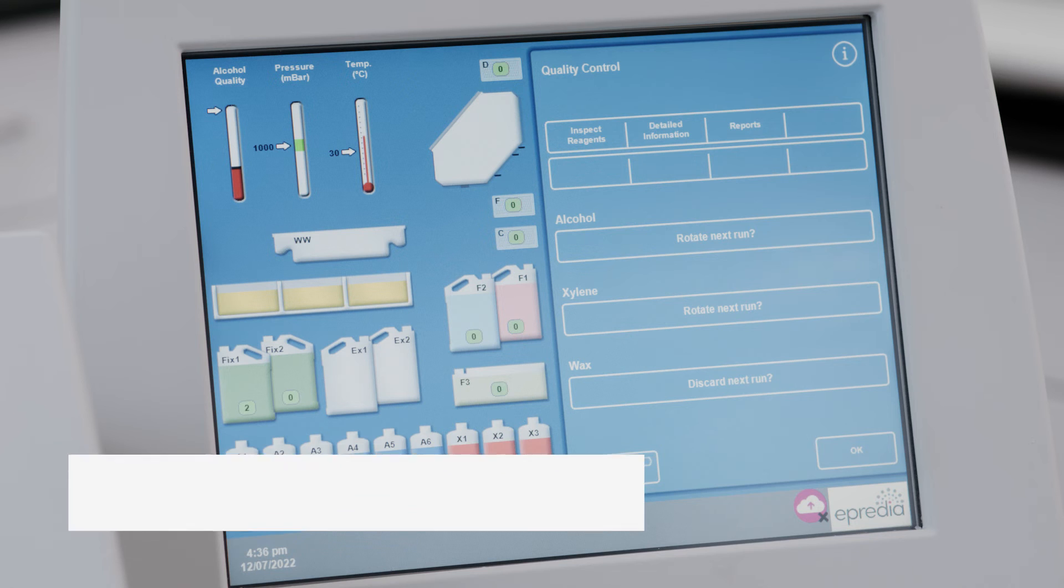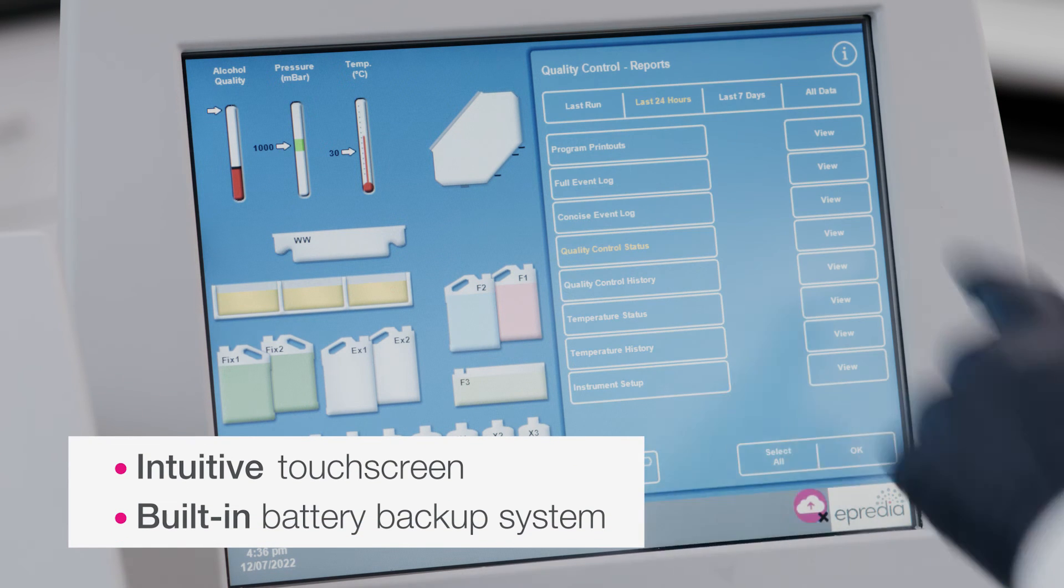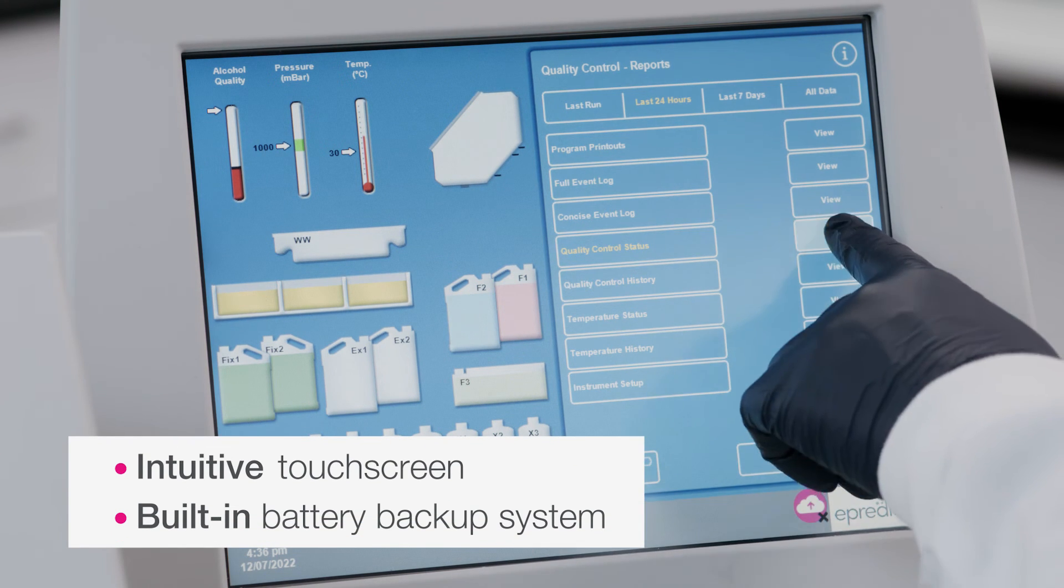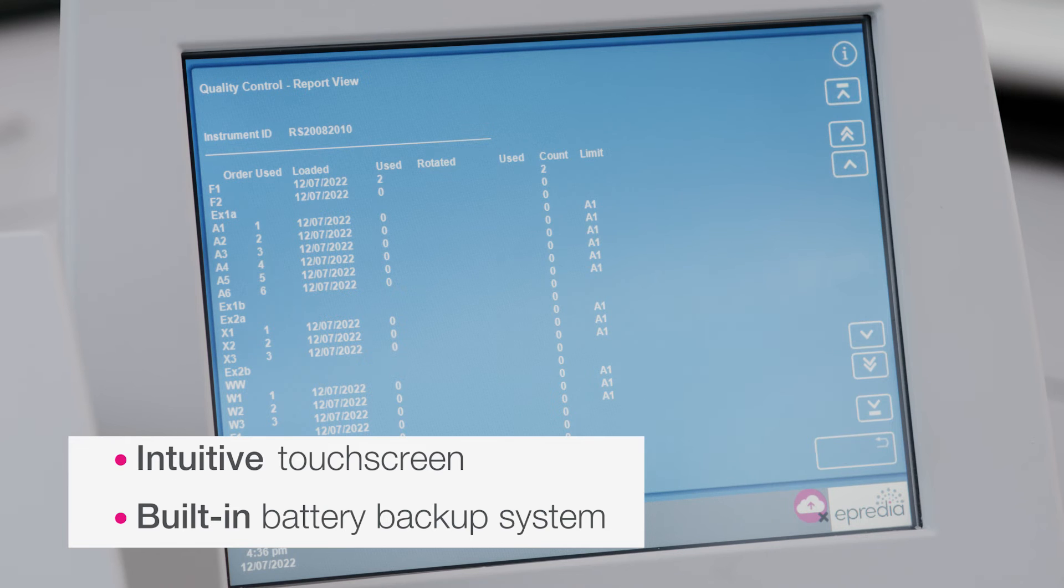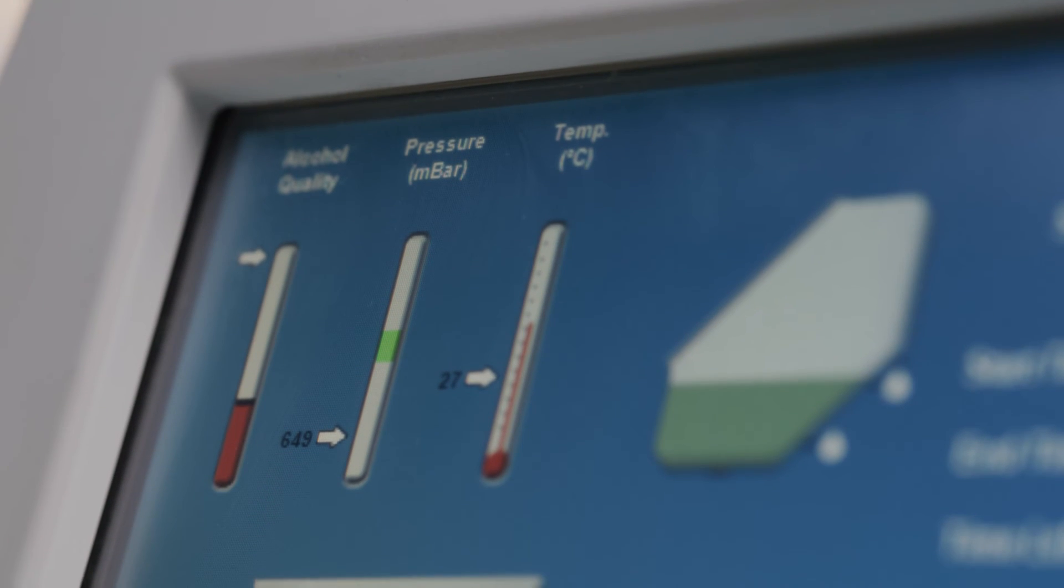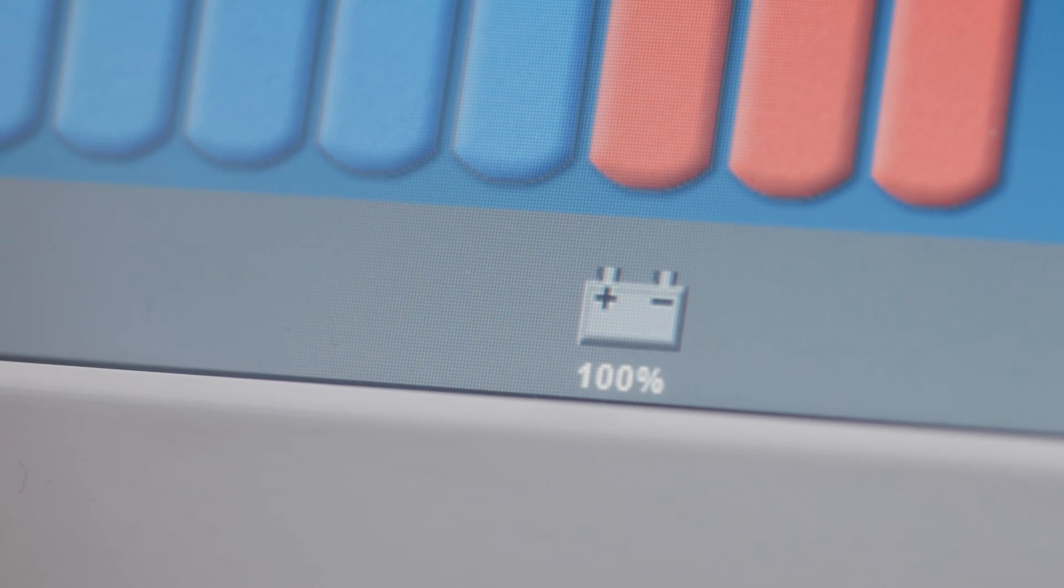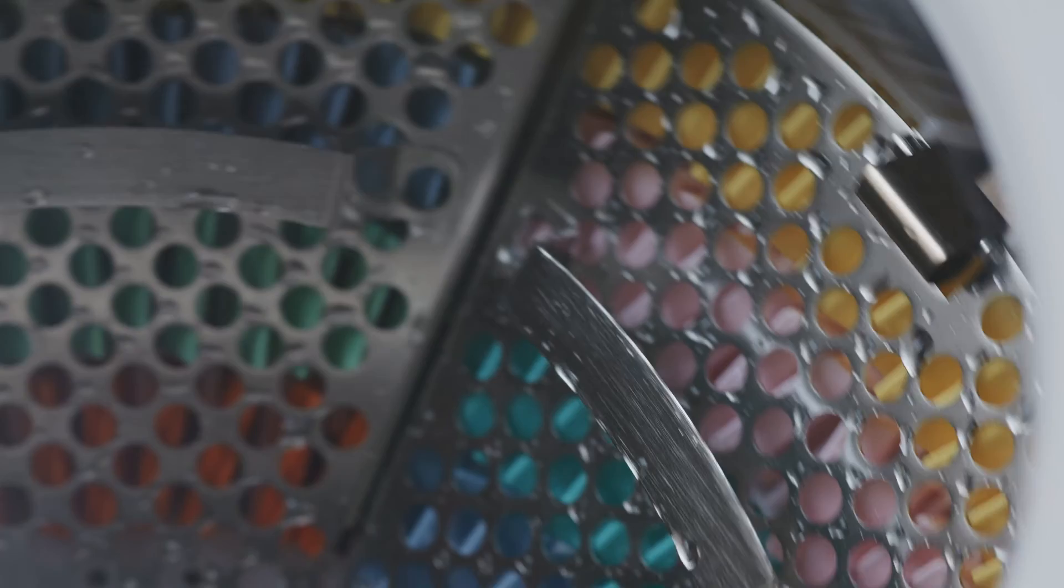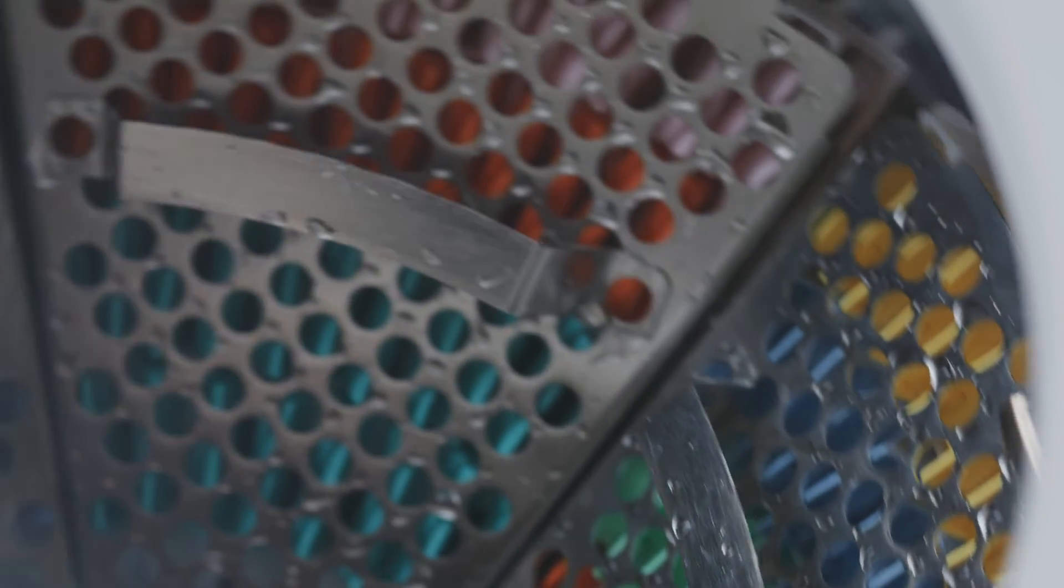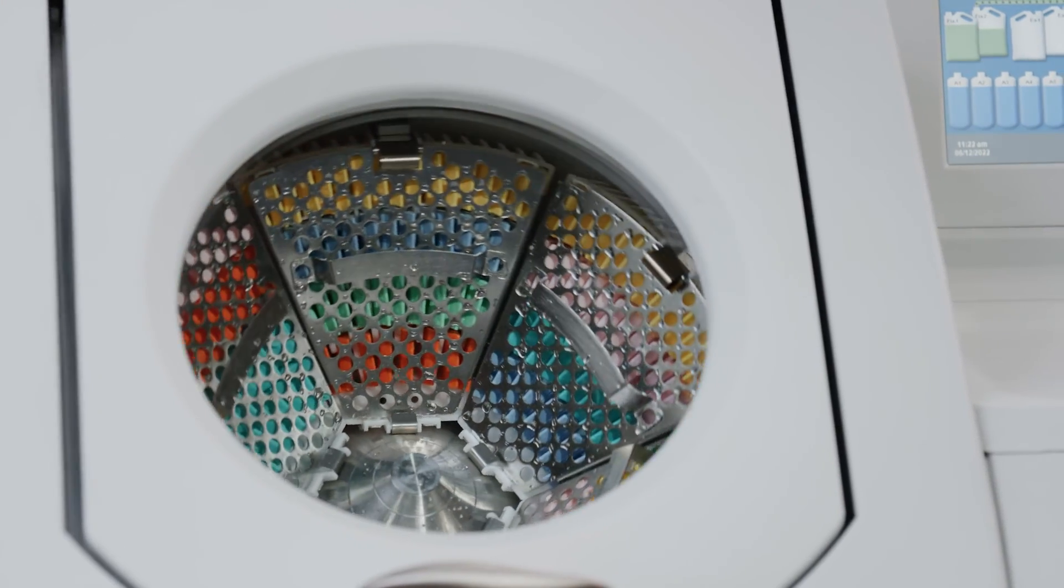The system's intuitive touch screen can be used to monitor instrument performance, set protocols, track progress, and view reagent usage. In the event of an unexpected power outage, the system's built-in battery backup system can keep your patient samples safe and protocols active for up to three hours.